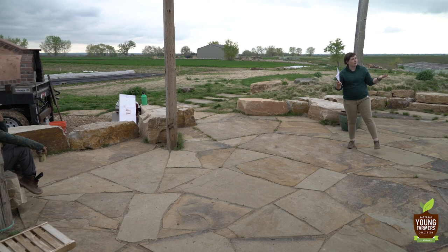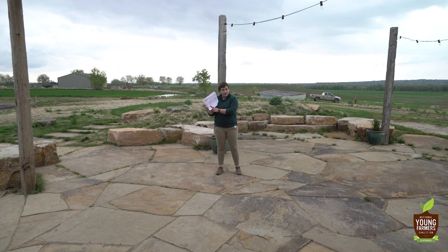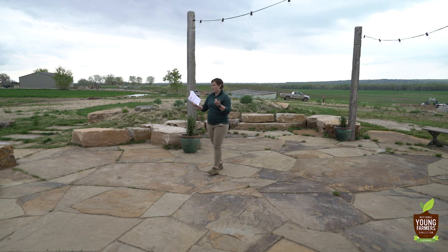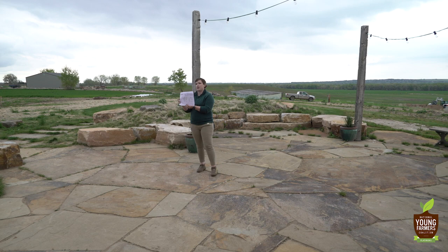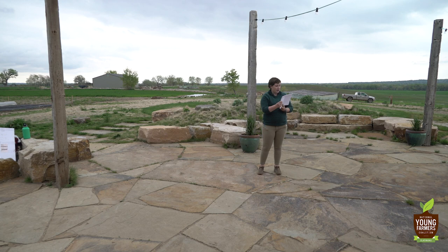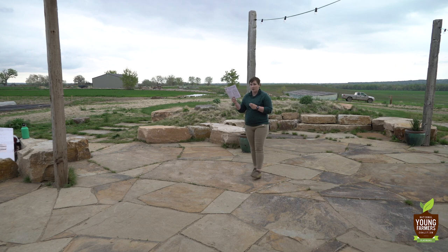We do know that our fungi will have different PLFAs from our bacteria, so we can get an estimate of how much fungal activity we have in the soil. And then we can break it down to our protozoa, which we don't like quite as much, and then undifferentiated, so we can't tell what exactly kind of critter that is. To prove the point, 37% of that sample is undifferentiated. So this one is actually looking pretty good. They gave the total biomass as excellent, so above average and good. That's looking pretty good, but there's still a lot of stuff that we don't know.